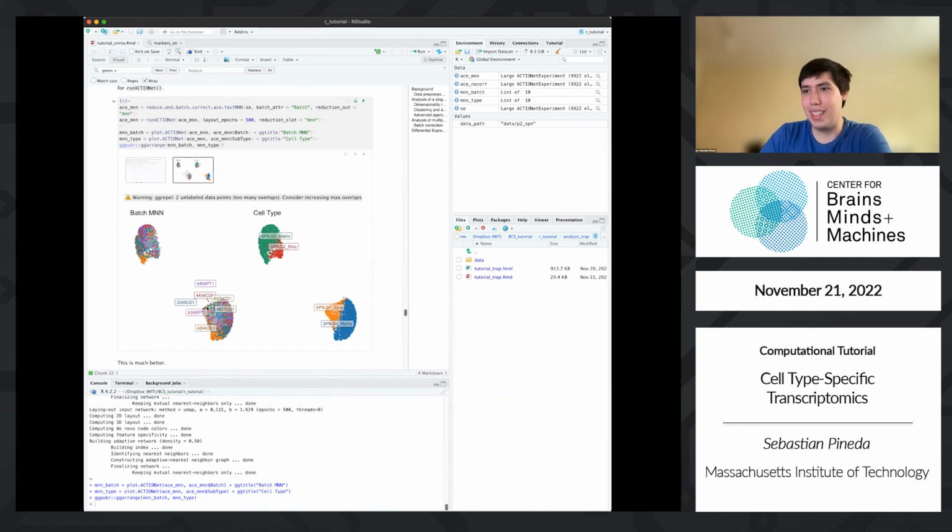This is the brute force method of getting rid of all the batch-effect-associated variance. Now, what's interesting about this is you don't give it a covariate. It doesn't know what the sources of unwanted variation are that I want to remove. It just guesses based on the similarity of data points across data sets. And even that is sufficient to do this kind of correction.